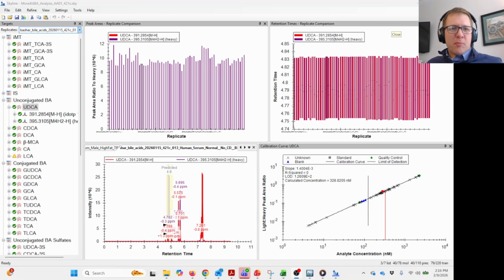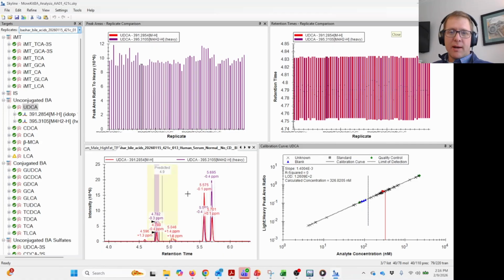One of the comments from a prior video was how the user liked to use Skyline to view the raw data from the mass spectrometry file. So in other words, viewing the mass spec signal spectra as opposed to just looking at the MS1 or the extracted ion chromatograms. So I thought it would be useful to just put together a quick video on how to do that. So if you don't know how to get to where I am right now, where I've got chromatograms, maybe check out video 1 on how to get extracted ion chromatograms from high-res data.